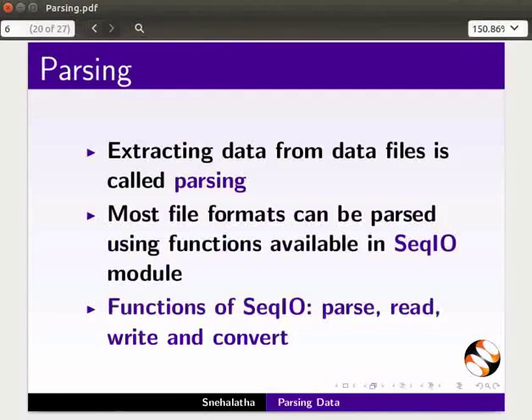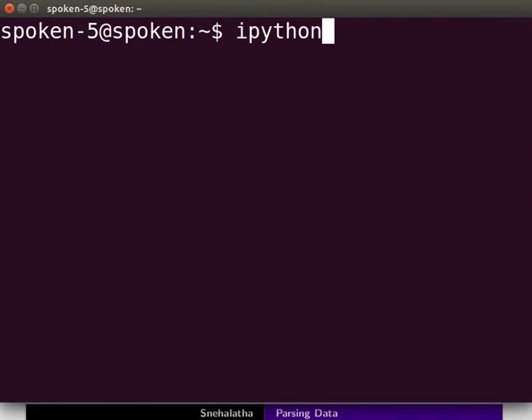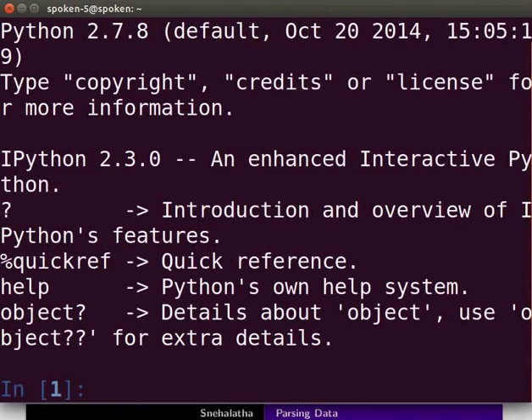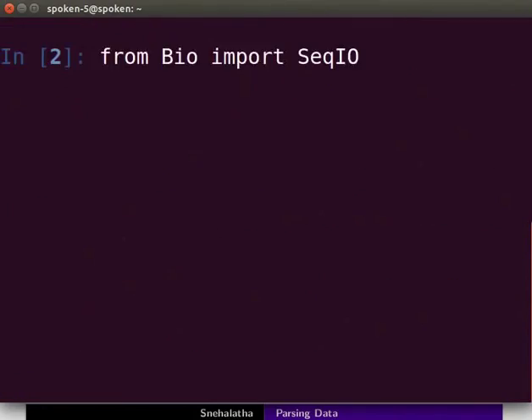Open the terminal by pressing Ctrl, Alt, and T keys simultaneously. Start IPython by typing 'ipython' at the prompt and press Enter. Next, import the SeqIO module from the Bio package. At the prompt, type 'from Bio import SeqIO' and press Enter.